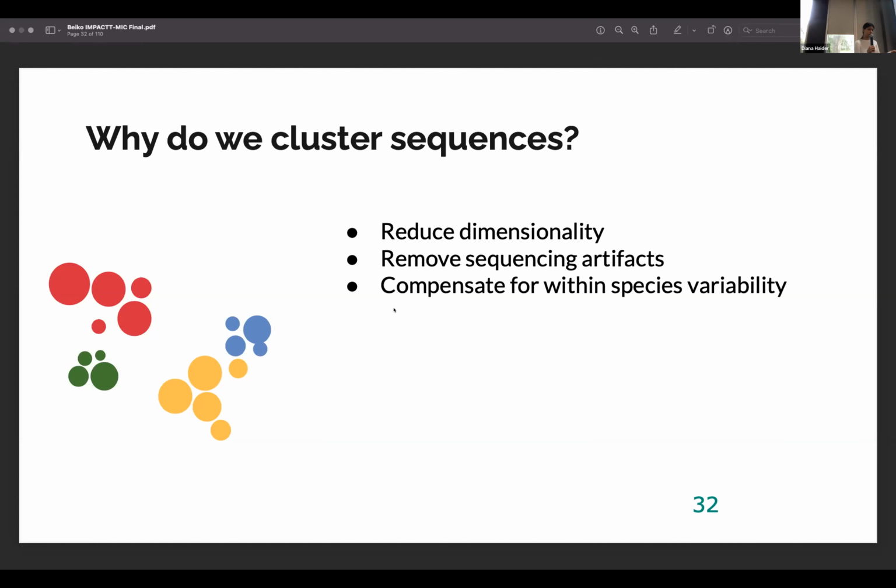So one important part of the clustering is to take all of those sequences and group them by what the algorithm thinks belong to one microbe. So instead of having thousands and thousands of sequences, you end up with only some thousand groups of sequences that would each one represent one microbe in your community. So you go from a very large file to a relatively smaller file.